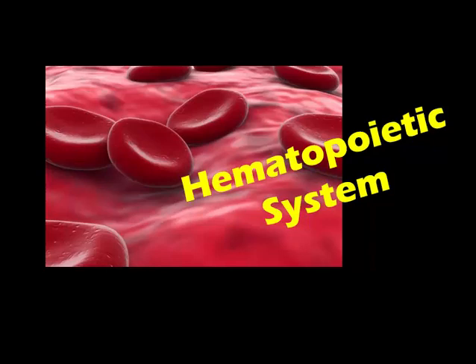A very common finding, especially as animals increase in age, are lymphocyte aggregates, which tend to accumulate in a number of very characteristic areas around the renal interlobular arteries, salivary gland ducts, within the urinary bladder submucosa, and other sites.